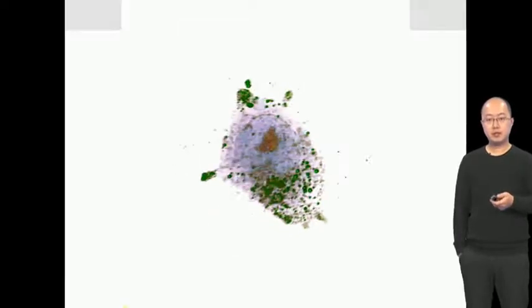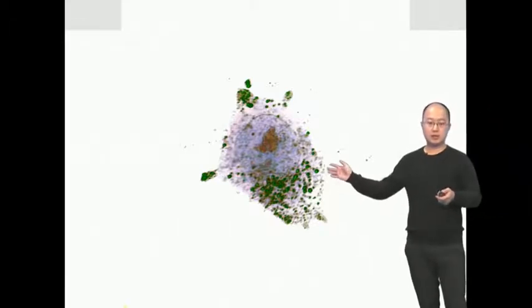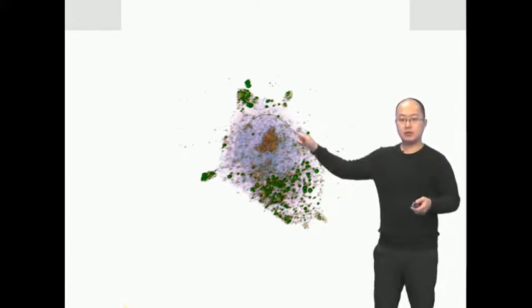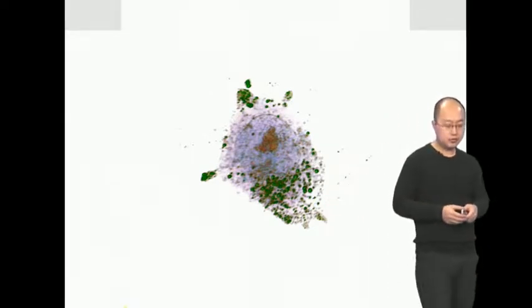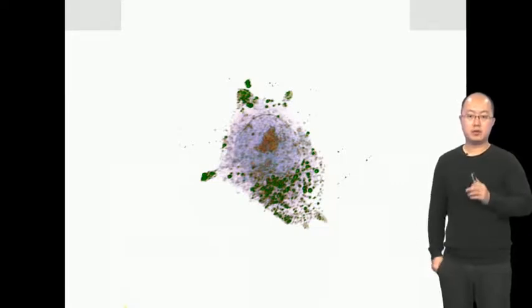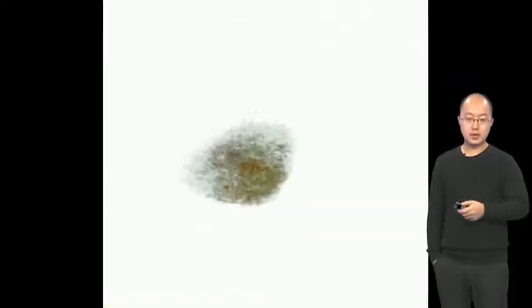And this is a hepatocyte, the cell in the liver, and you can see very nicely the lipid droplets having high refractive index, and this is one cell, and this is the cell membrane, and this is the nuclear membrane, and this is the nucleolus. So without using any exogenous labels, the measurement of the three-dimensional refractive index tomogram can directly visualize the subcellular structures of the living cell.